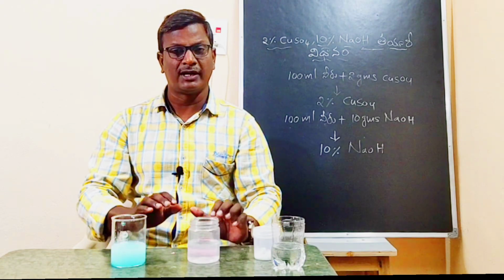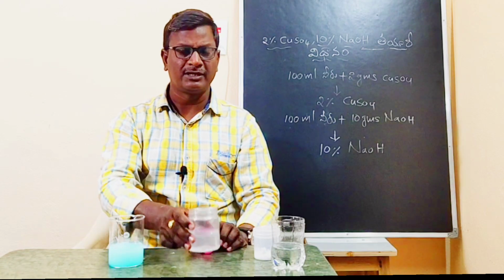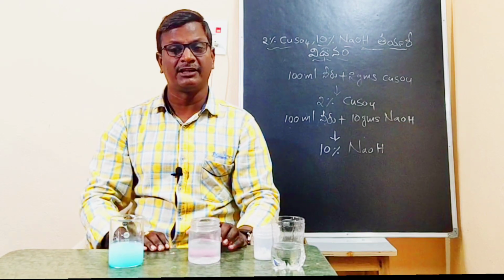Students, I think you understand how to prepare 2% copper sulphate and 10% sodium hydroxide.